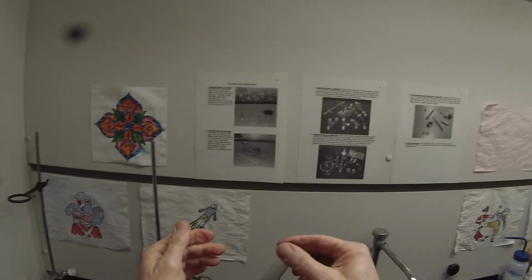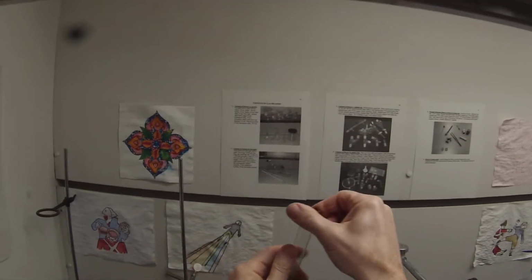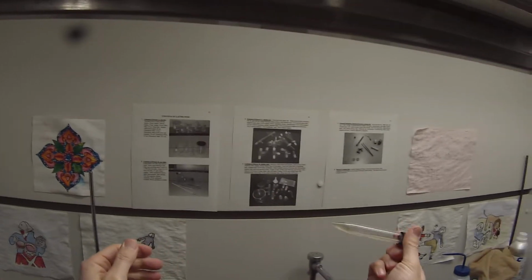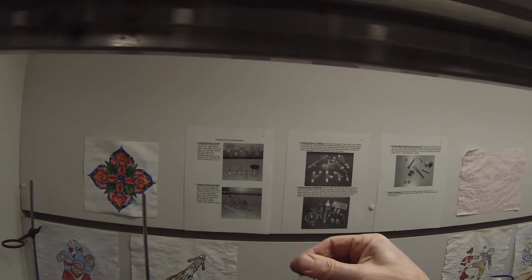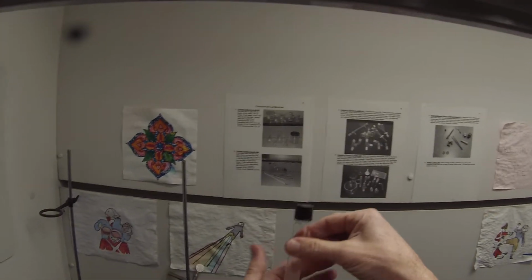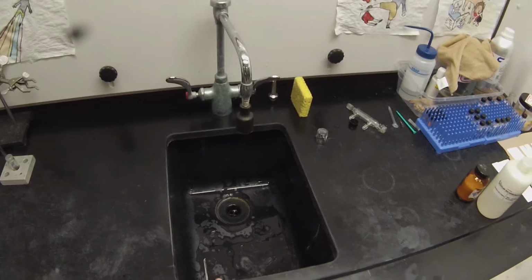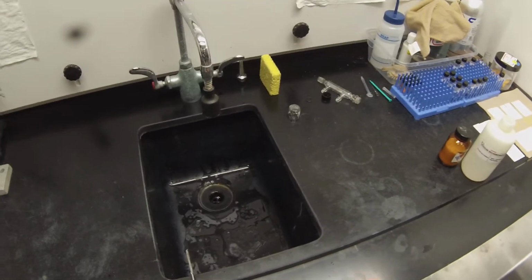Cap it up, mix and vent, mix and vent. You want to keep the mixing and venting until you don't hear it hiss when you open up the vent. Let that settle. And while that's settling, we can measure the pH of this second water layer. I expect it to be acidic, but less so.